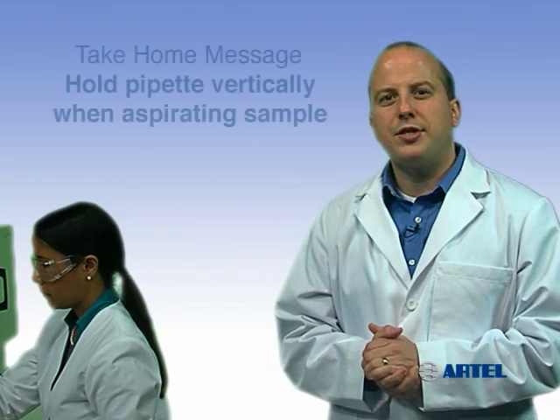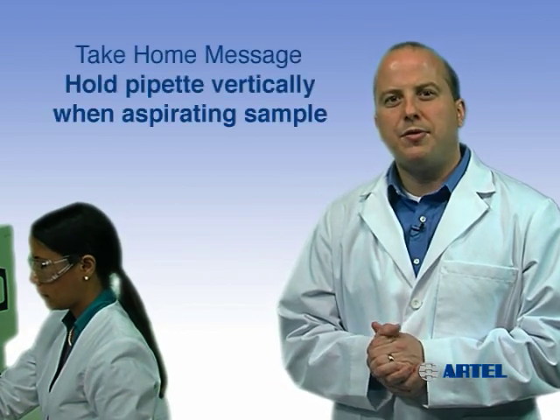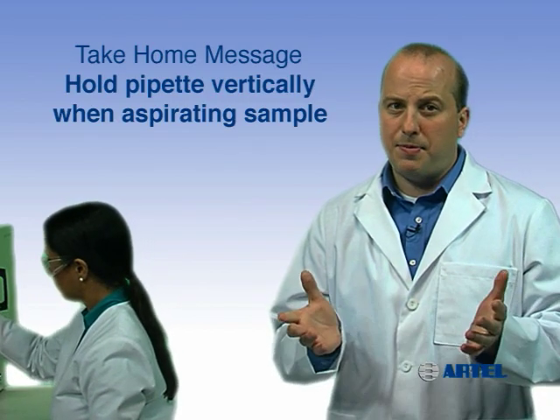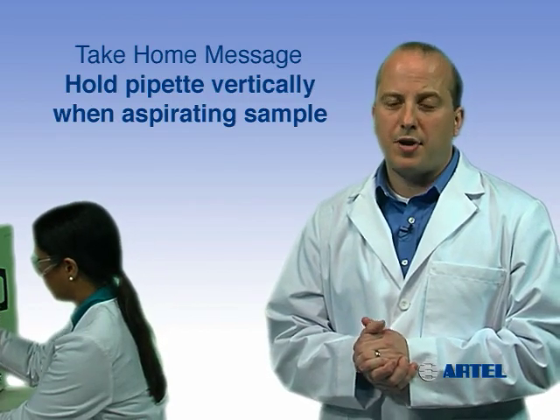This causes inconsistent volume transfers. The take-home message: during sample aspiration, always hold the pipette vertically and avoid touching the sides of the container. After sample aspiration, pull the pipette straight out of the liquid.